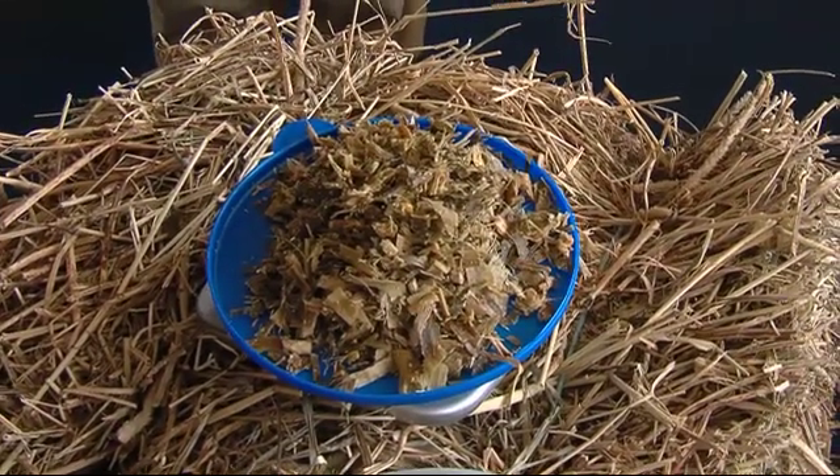Getting the moisture content of your wet ingredients is important because it will affect the entire TMR. Getting your TMR mixture correct is essential because nutrition matters.